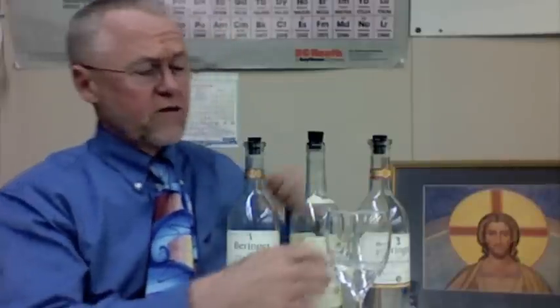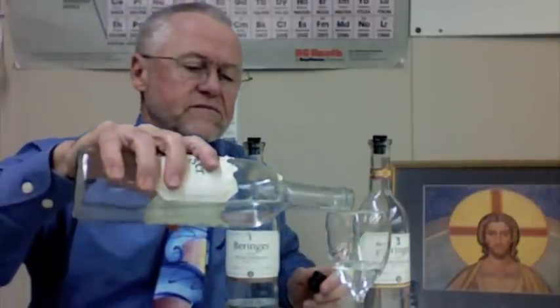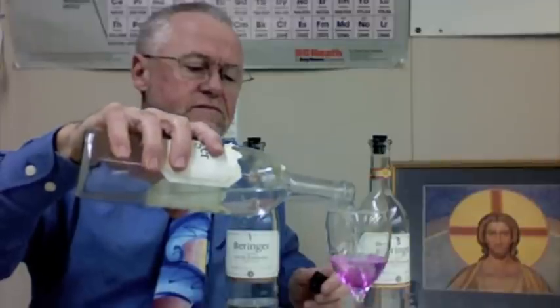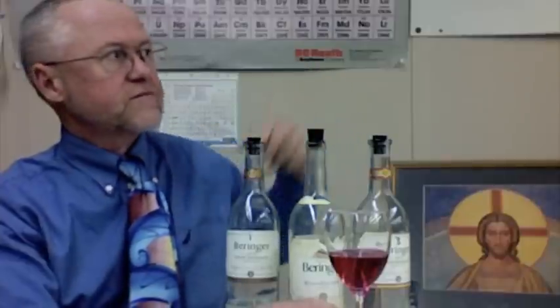It's back to water again. If I want the wine, I can make it go back to wine again. There it goes. There it goes. So, let's end it up with water again.